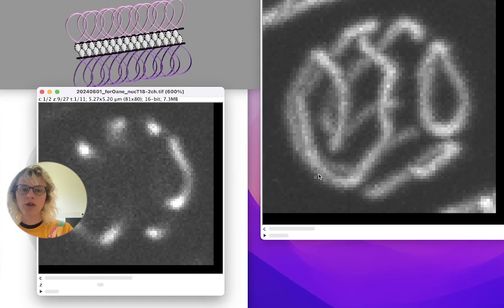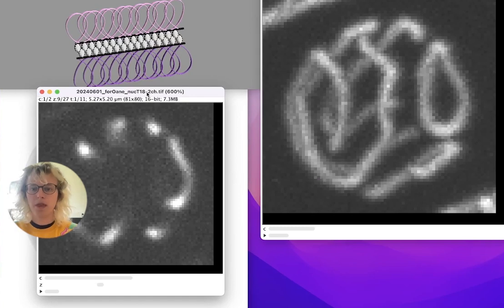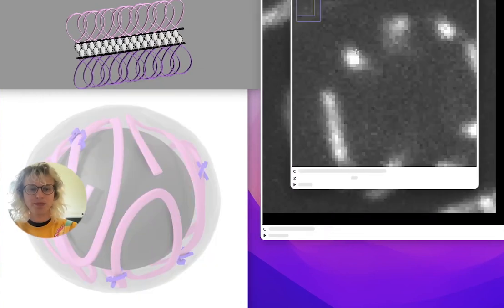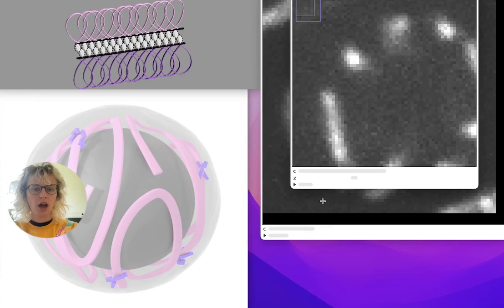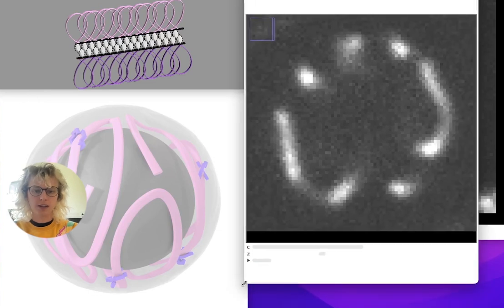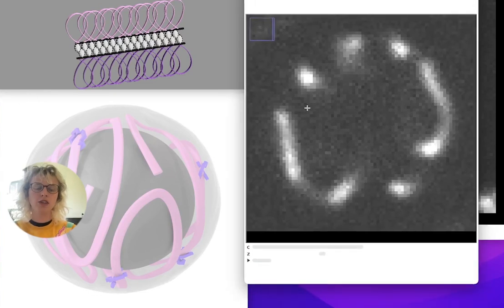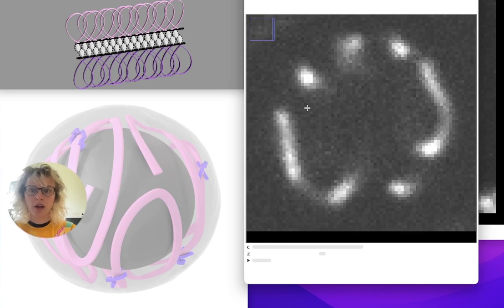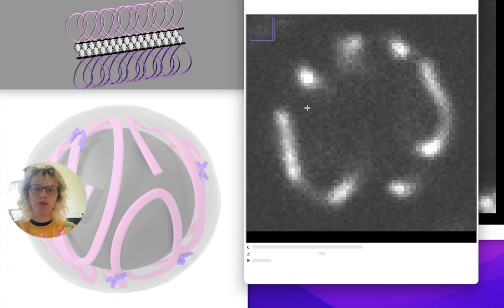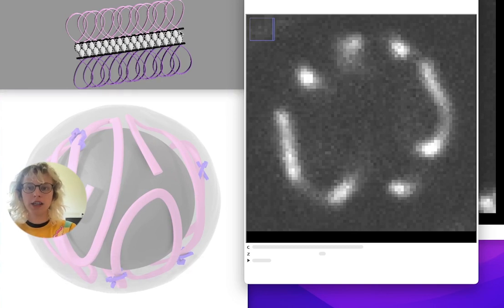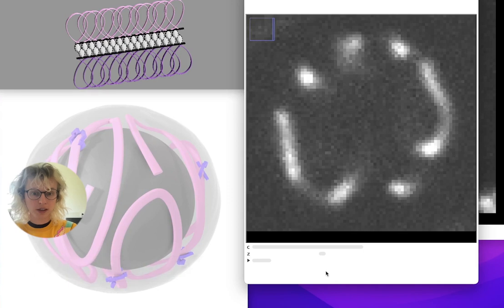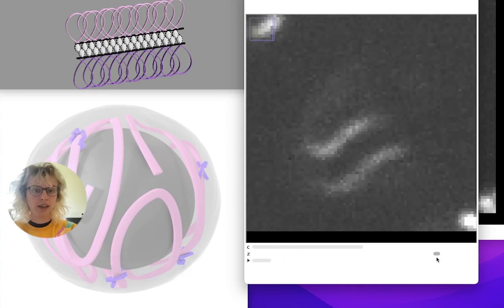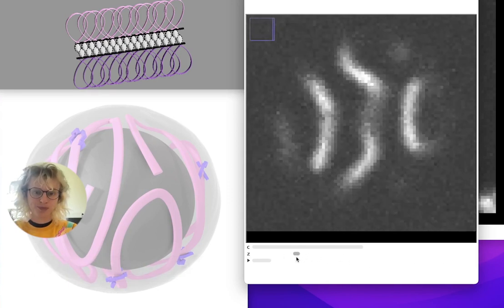So we have this stack of C. elegans meiosis data. We're looking at late prophase 1, where we have the homologous chromosomes that are bound together with the synaptonemal complex, which we see here in our Z-stack.